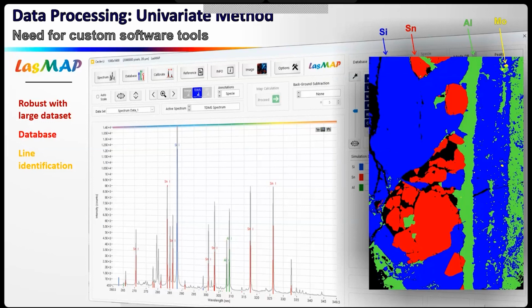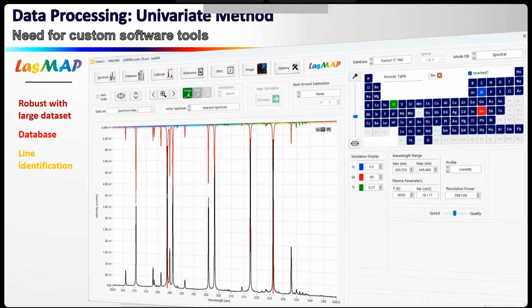So, okay, in blue, we have aluminosilicates. In red, we have strong tin signal, and we dissociate from that. And so we have 4 different regions of the image. So we will calculate the average spectra related to each of these masks. And we continue, second iteration.